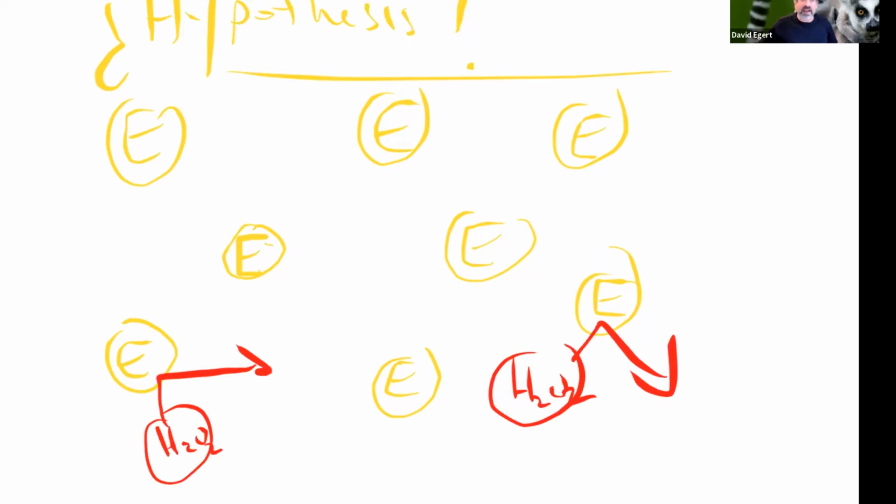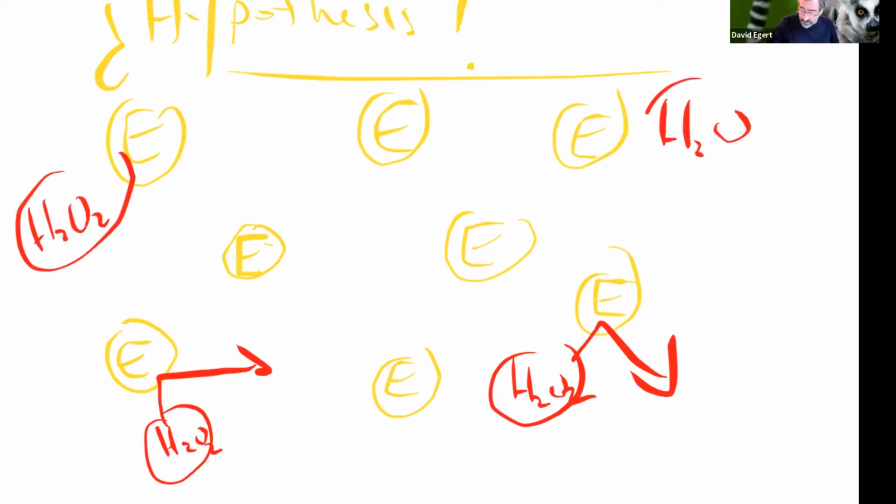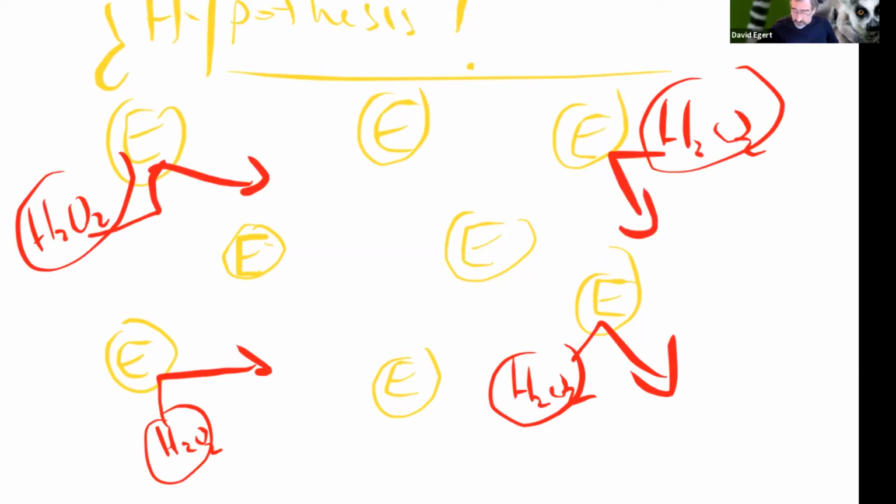Now let's say instead of having 2, I had 4 of them in here. I've doubled my concentration of H2O2. There's twice as much for the same volume. Assuming there's enough enzyme, these are going to be banging into enzymes while these are banging into their enzymes. So we're going to be making oxygen twice as fast as we would have otherwise, right?